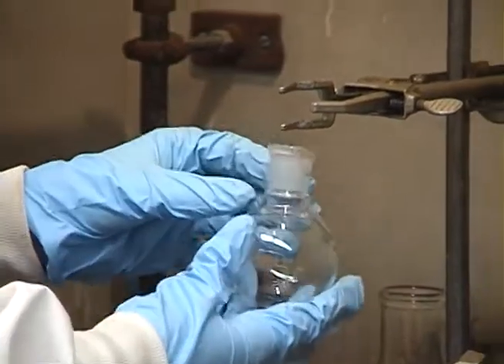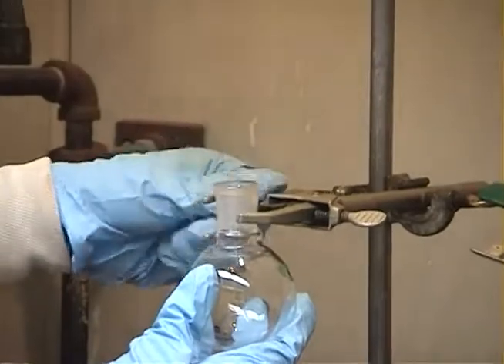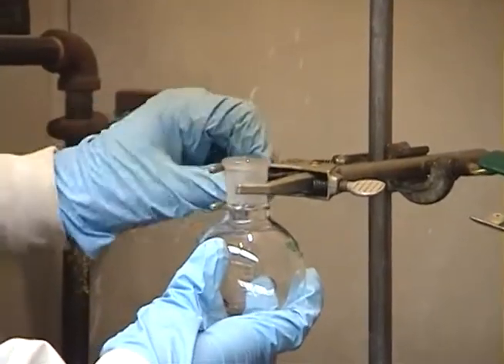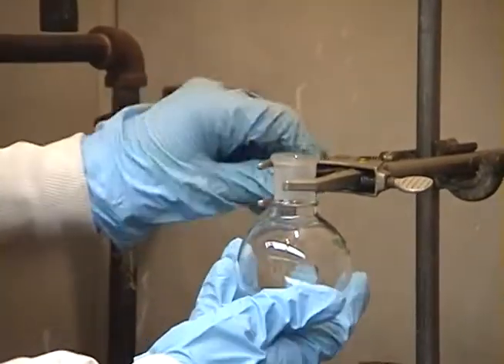First, a round bottom flask is clamped to one ring stand. The flask must be large enough that the solution does not take up more than half the flask.